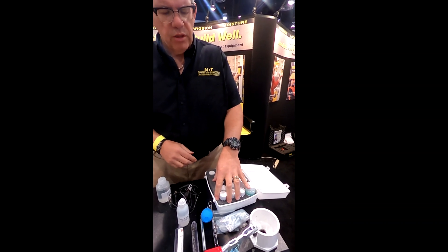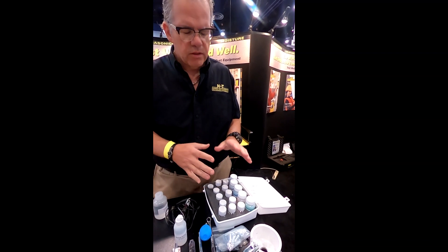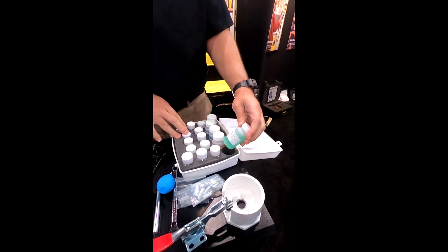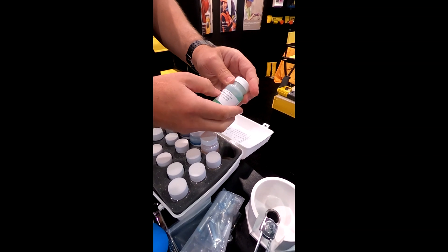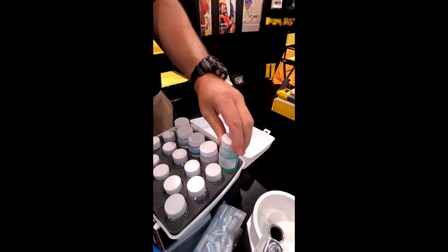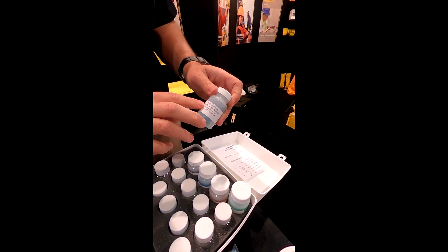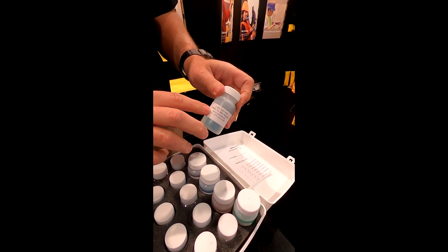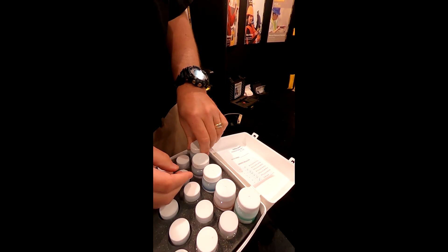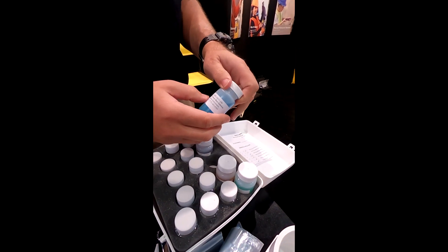Some practitioners like to just let them sit overnight; some will take readings after 3 to 5 minutes — it varies. We also have the calibration solutions here. Each one is calibrated for different percent levels by weight of chloride. This one is 0.3%, going down to 0.05%. Please understand that this is a very low level of chloride, and it's very easy to contaminate the 0.005%, the 0.01%, and the 0.05% solutions.